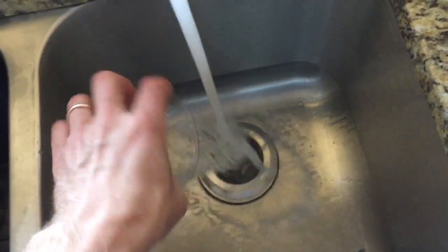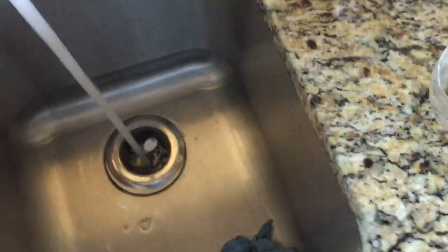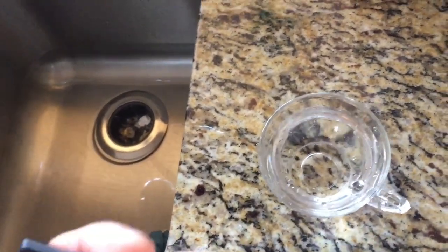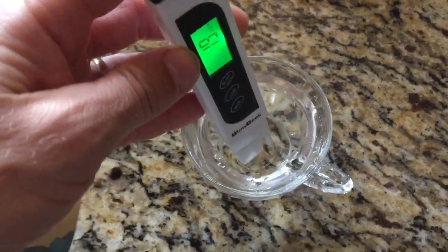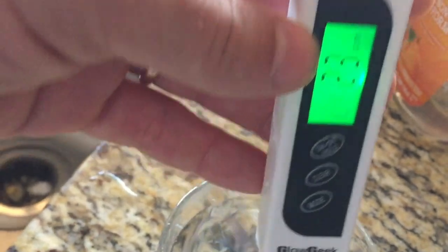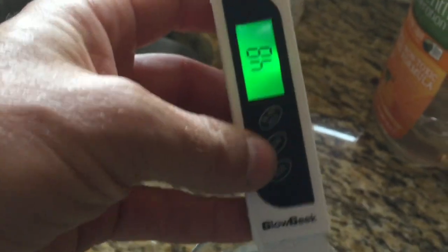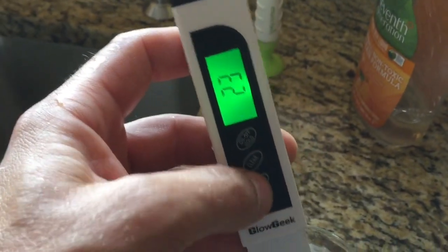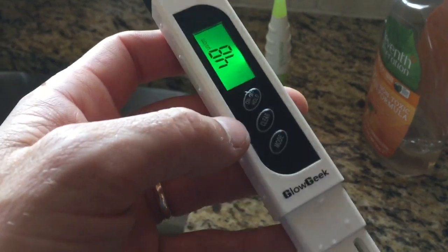Let's try the tap water first. So the result is 23 particles per million for tap water, and switching to mode, it's 48 for electrical conductivity. So tap water is 23 PPM and 48 EC.